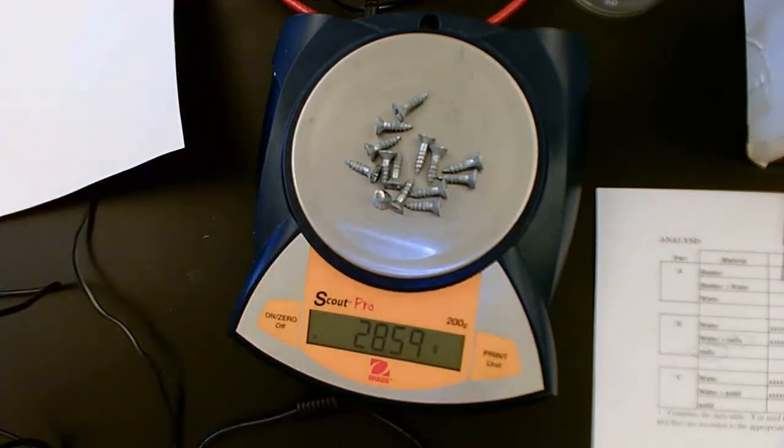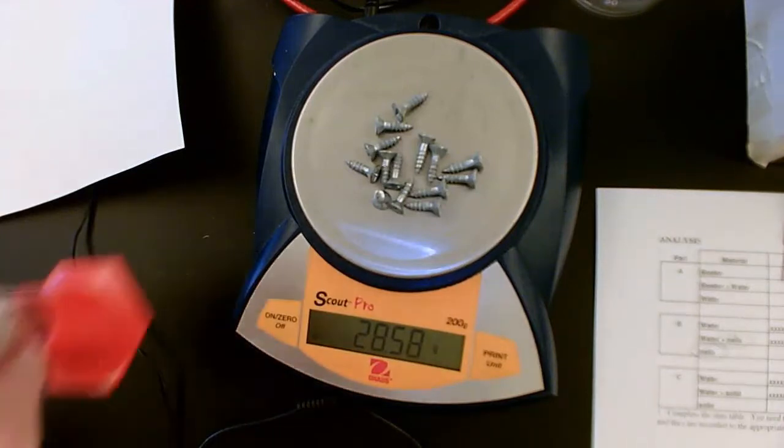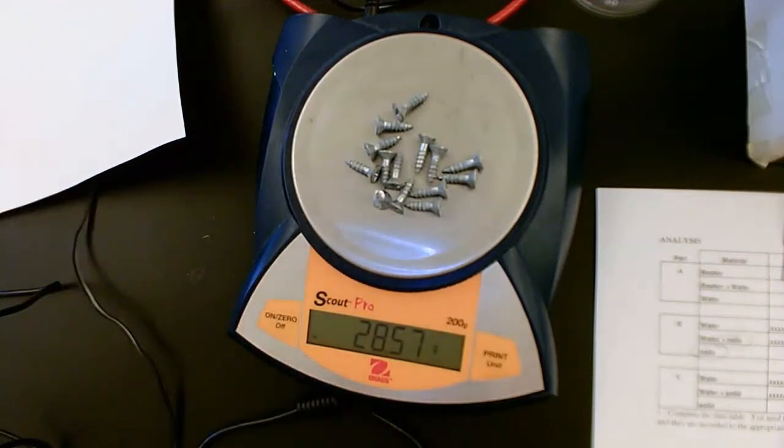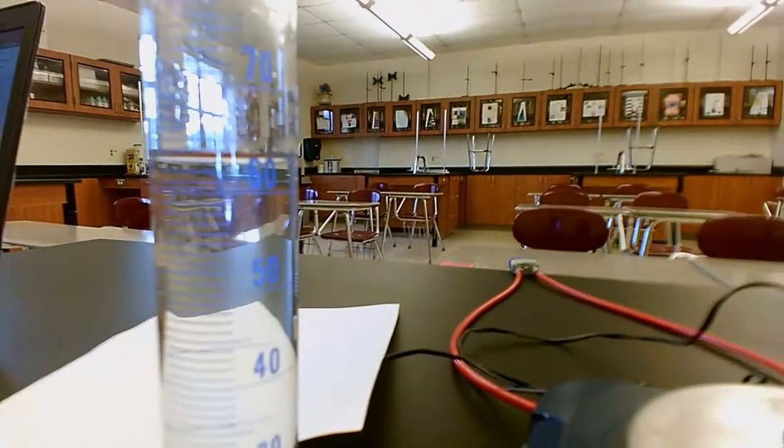The next thing we have to do is put some water in a graduated cylinder, and we're going to take a reading. All right. So we're going to take a reading off this graduated cylinder, and I know it's hard to see right now. We'll fix that.